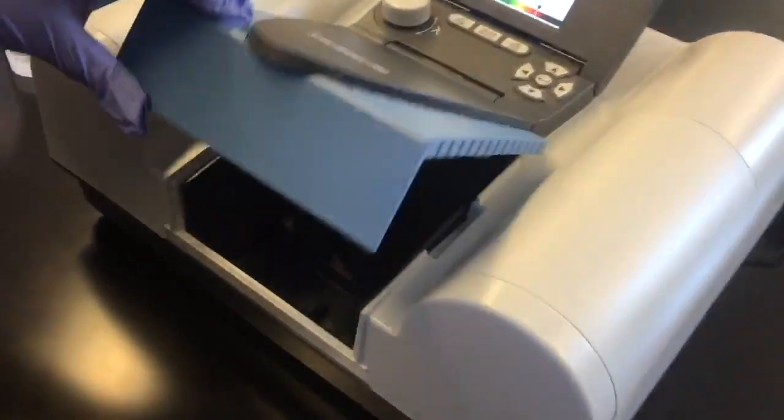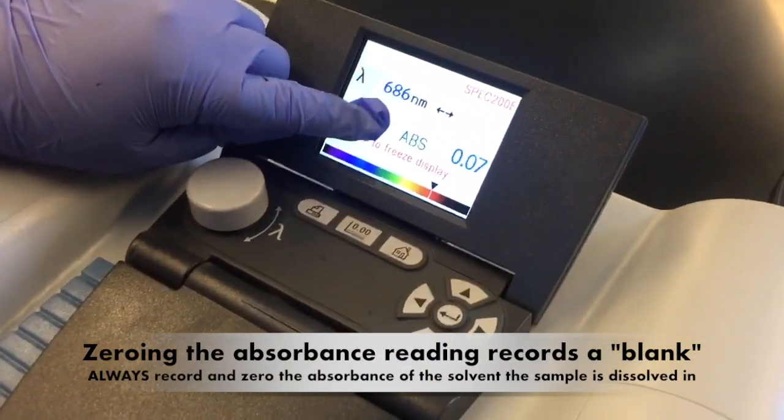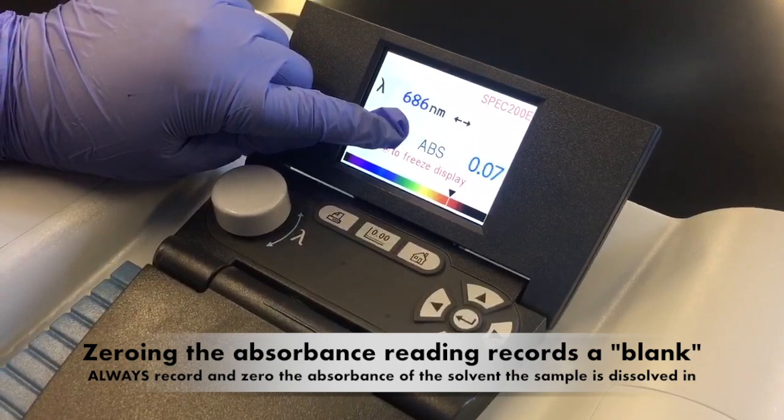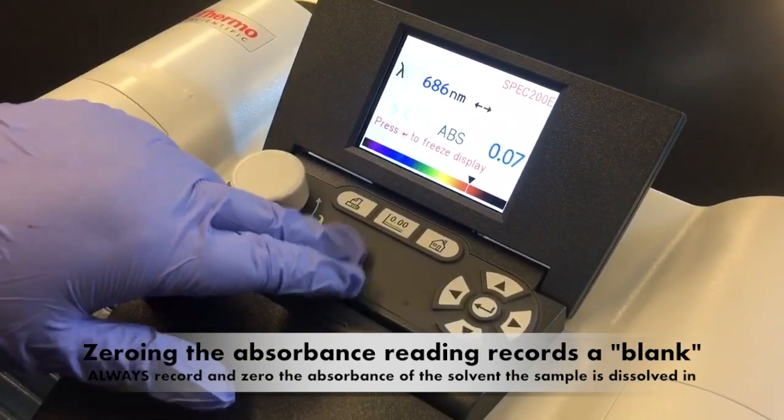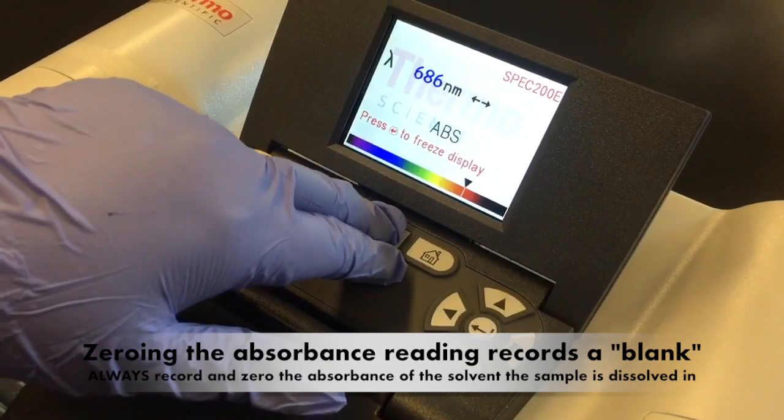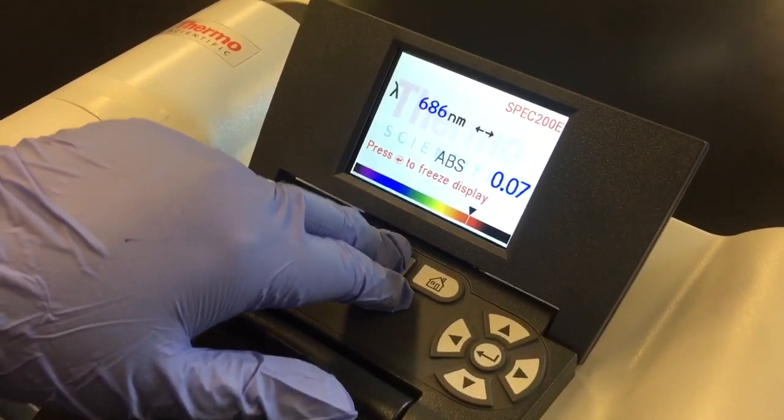Then you're going to close the lid. As you can see, it reads the absorbency rate at 0.07, and what you want to do is press the 0.00 button. This zeroes out the DI water so we can compare future solutions.